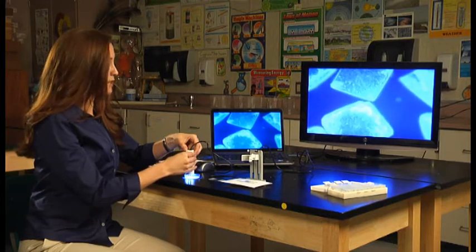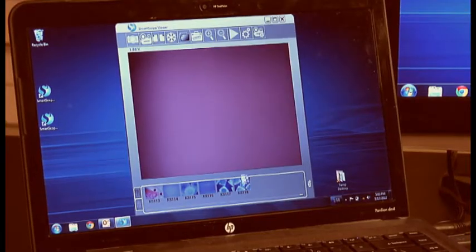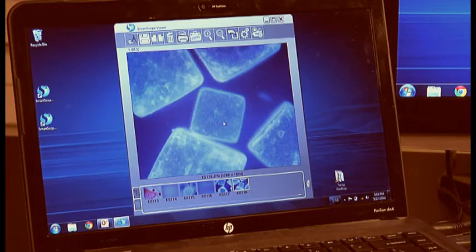So if you want to capture that, just take a photo. And then again, to view the photo, all you have to do is double click, and then you can drag and drop, and there's your photo.